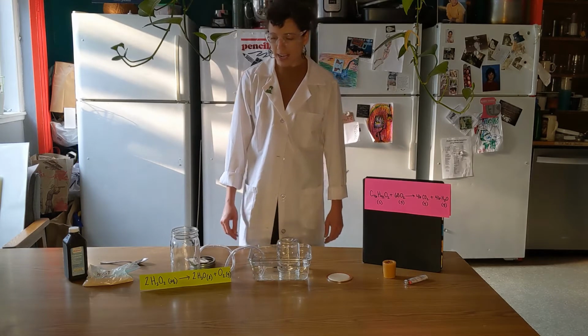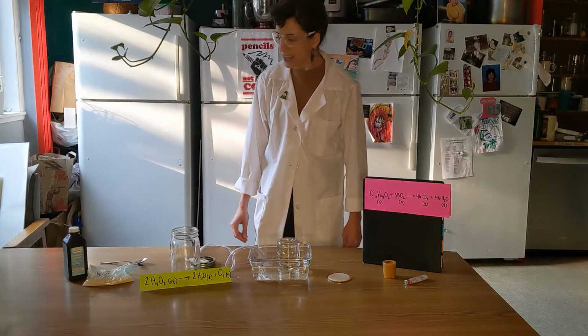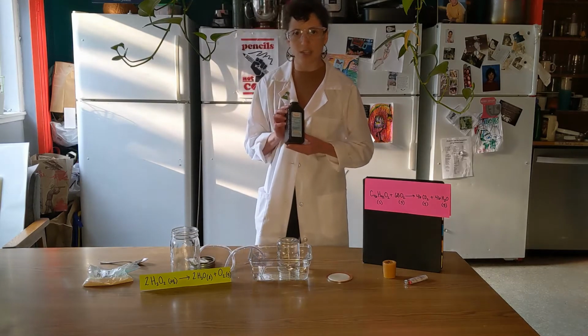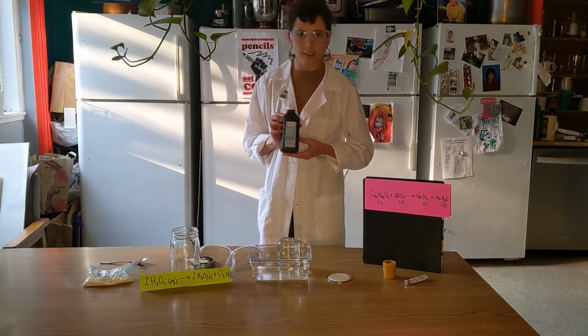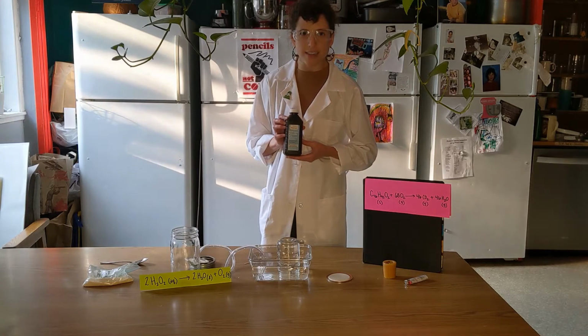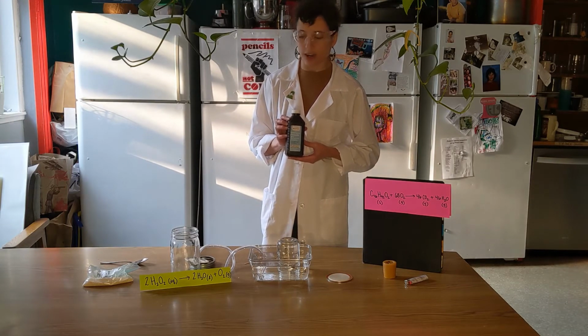So I'm going to do a little gas experiment here for us using things that I found around my house. What I'm going to do is decompose hydrogen peroxide. When hydrogen peroxide decomposes, it turns into oxygen gas and water. And you've observed this if you've ever poured hydrogen peroxide onto a wound, because your blood contains an enzyme that catalyzes this decomposition reaction to produce oxygen gas.